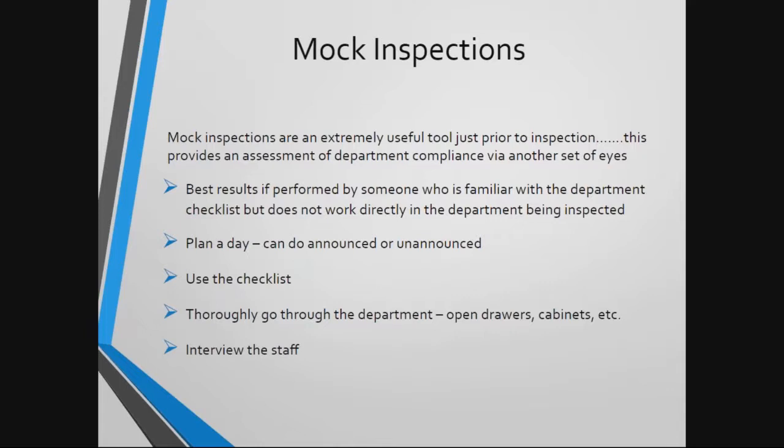When I perform the mock inspections, I will generally take both the histology and the cytology checklist with me and just kind of pretend to be an inspector. I'll go through drawers, cabinets, refrigerators, freezers, flammable cabinets, etc. I interview the staff as much as I can. This serves a dual purpose in playing a role to assess department readiness, but is also helpful for your newer staff that might not be as familiar with the inspection process. It effectively assists in making them feel more comfortable when the actual inspection time rolls around.